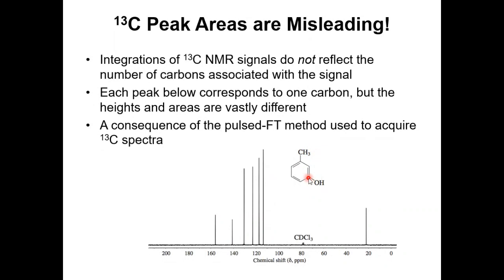And then the next unique carbon is the ring carbon connected to oxygen. Because all other ring carbons are connected to either hydrogen or carbon, they don't connect to oxygen. So this ring carbon connected to oxygen is unique. And this one gives you a peak at close to 160 ppm because oxygen is the most electron withdrawing group here, so it deshields the carbon directly connected to it. Then this carbon is also different from this carbon, although both are ring carbons.